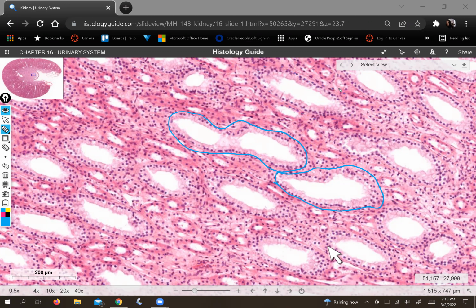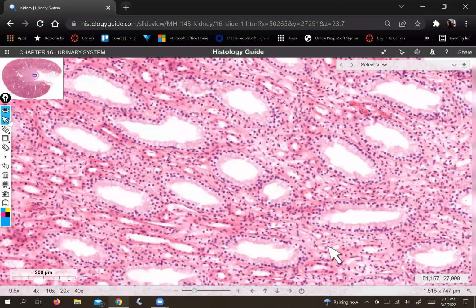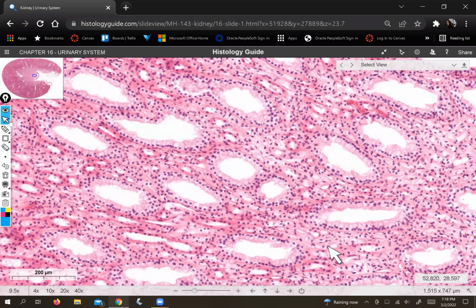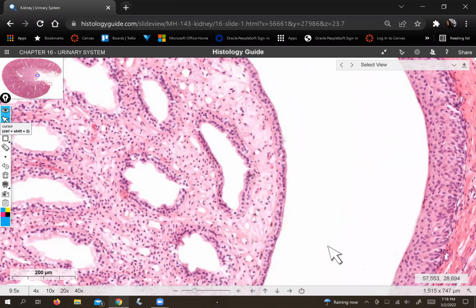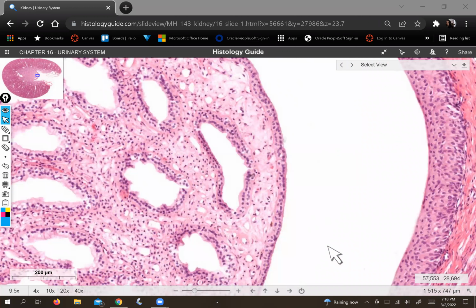So as the epithelium of the collecting duct approaches the end, we start to call these papillary ducts. They're still collecting ducts. It's not that it's a different tube. It's just when we can see that the tube is close to its exit and that its epithelium has changed significantly, we start to call it a papillary duct because we know that we're near the renal papilla. So which means that if we continue following these things down, we should get to, oh, voila, the renal papilla.